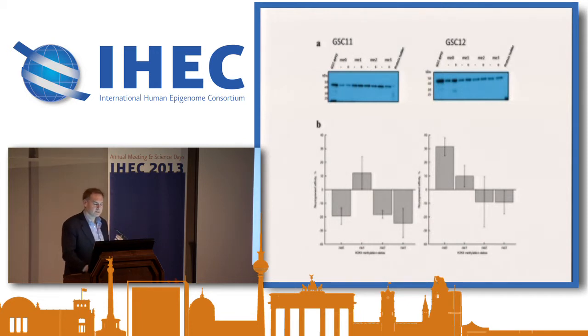And we can see that the two compounds that we've identified so far basically modify the behavior of BPTF in different ways. So this one here, in the presence of the compound, instead of binding to ME3, actually now gives a much stronger binding to the non-methylated form and some binding to the monomethylated form, and seems to select against binding now of any higher methylated numbers.